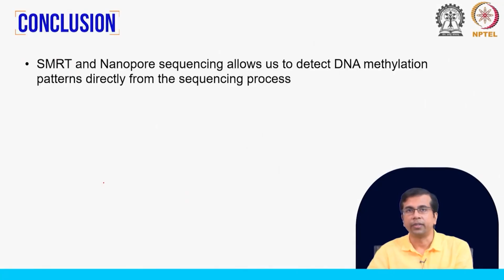Here are the references for this class, and to summarize, we have talked about direct detection of DNA methylation patterns using two different next generation sequencing methods, single molecule real time sequencing or SMRT sequencing, and nanopore sequencing. And we have seen that they apply two different principles to identify these methylation patterns. The SMRT utilizes two parameters, which are interpulse duration and pulse width. So, based on the distribution of values for these two parameters, the method can distinguish between methylated bases. And nanopore sequencing looks at the current signals, and each modification has a distinctive influence on the current signal, which can then be utilized to identify the modification.